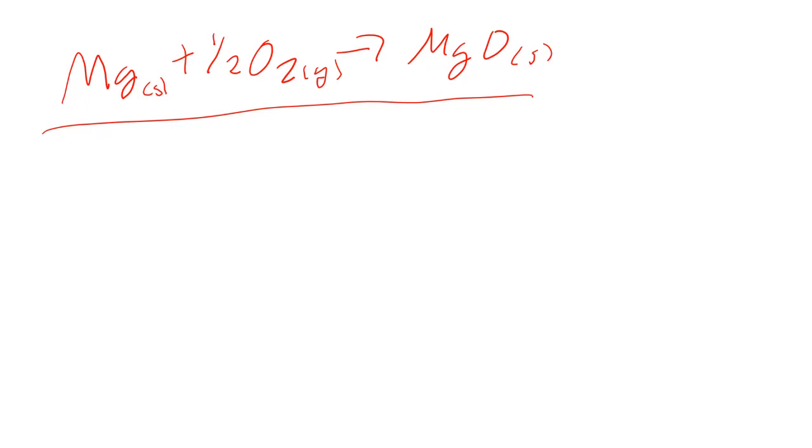Otherwise, you're going to follow the instructions in your procedure. You will use the temperature probe with the LabQuest device, but you don't need to get a graph or anything. You're just going to record the temperature changes. And once you've recorded your temperature changes, then let's talk about what you're going to do with your data.